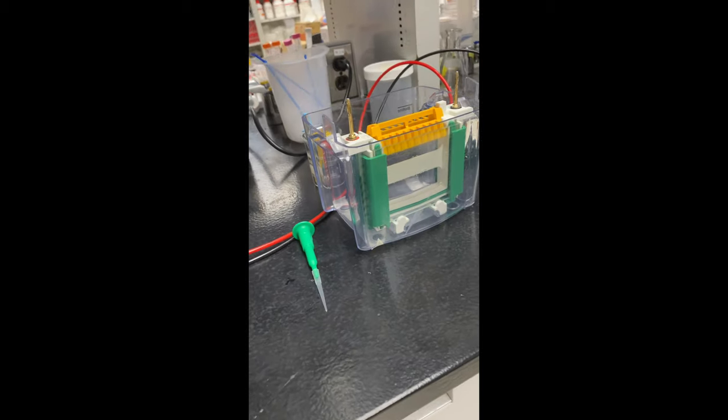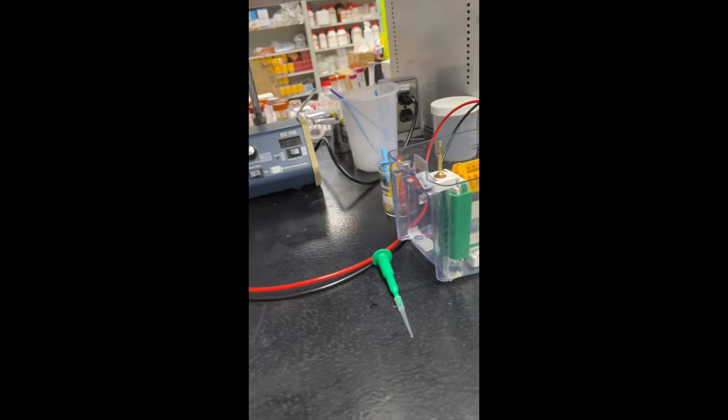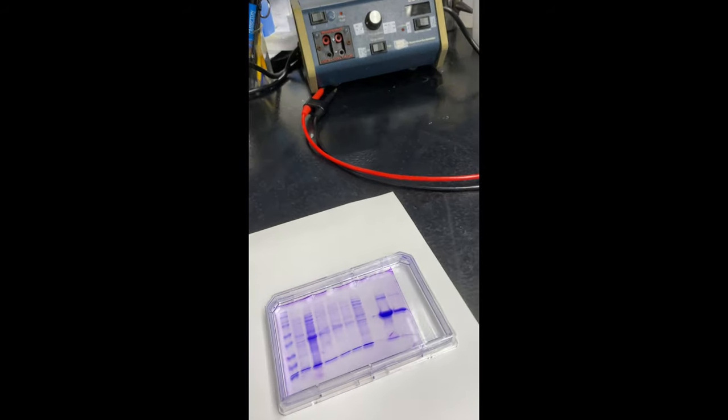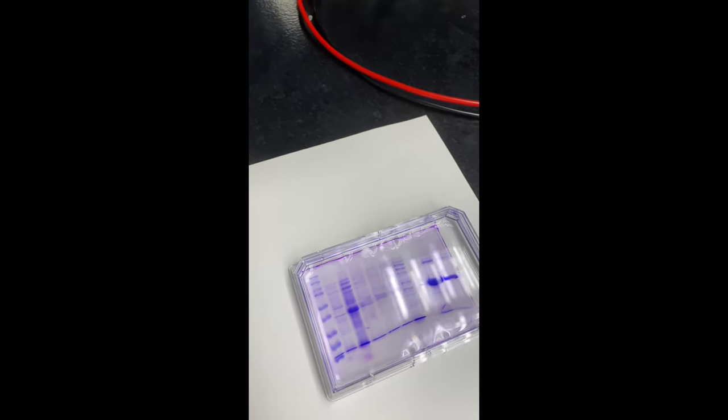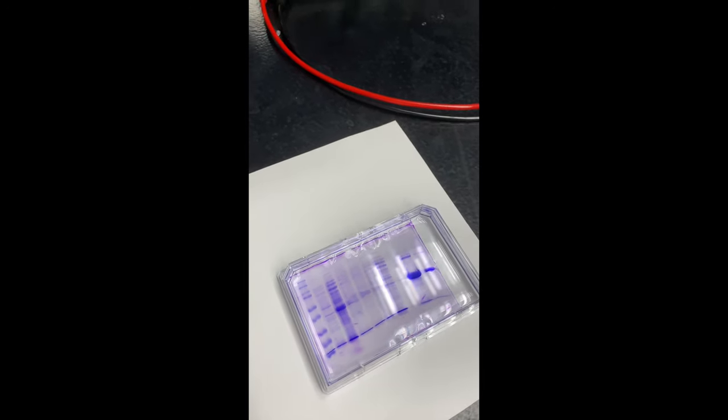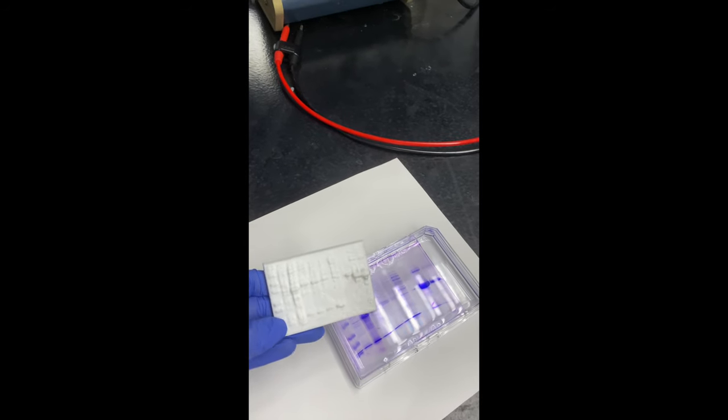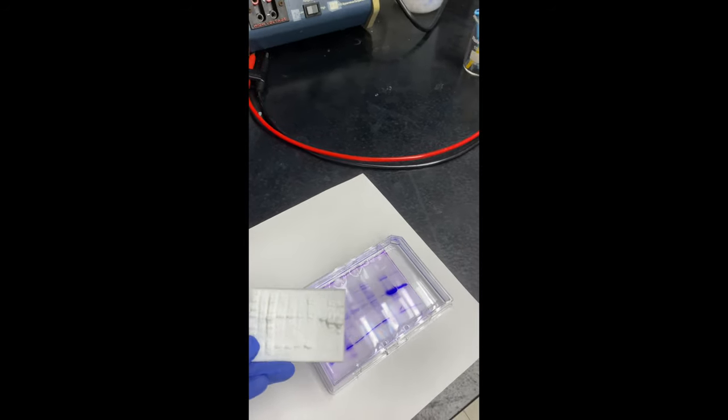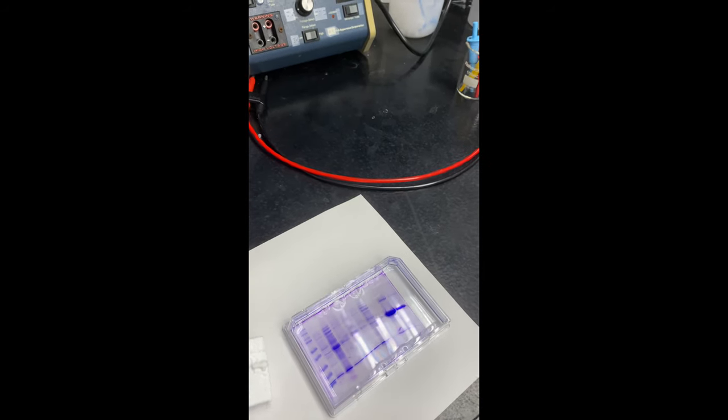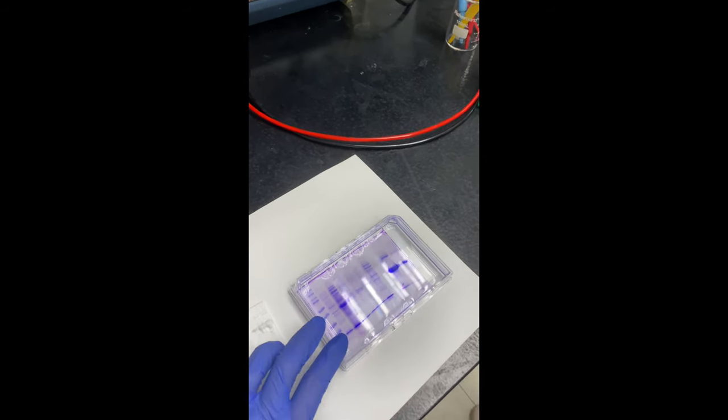Then we can visualize how big the proteins are. The proteins are blue in this old gel as an example, and we also have a 3D print of what a gel example looks like so you can feel it as well. Do you want to come touch these, Emmy? Sure. So you want to touch the real gel? Okay.